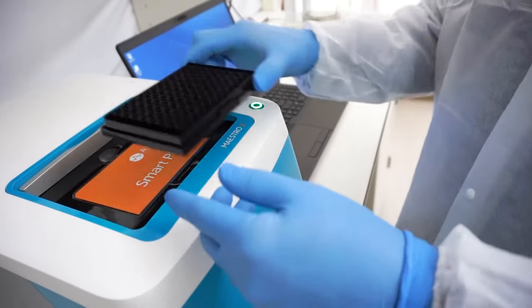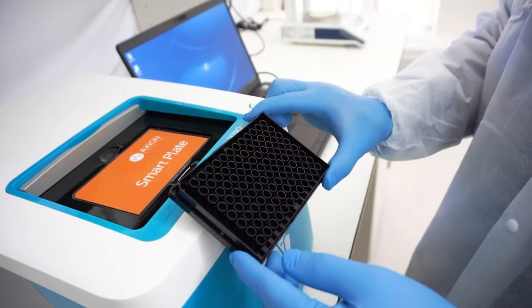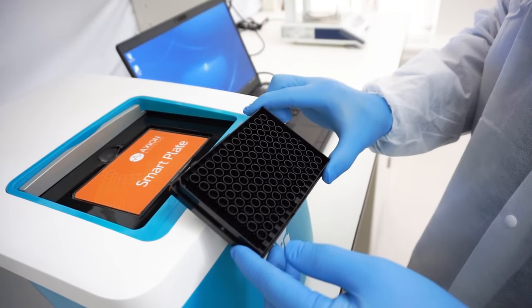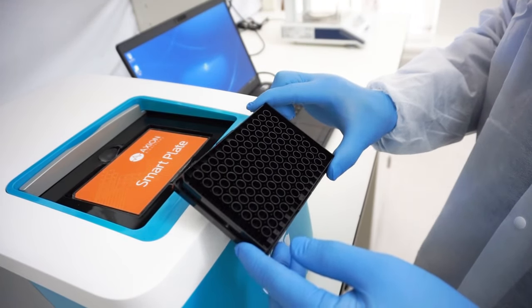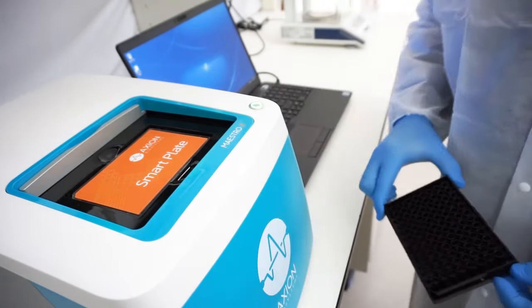Electrodes embedded in the culture surface of the Cytaview Z 96-well microplate are used to quantify cellular changes. The viewing window in the center of each well allows cell visualization and the possibility of multiplexing with imaging assays.